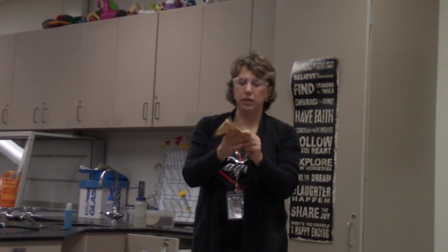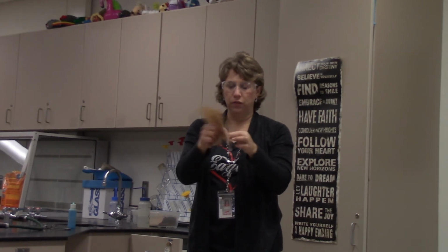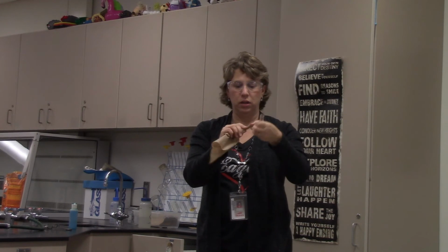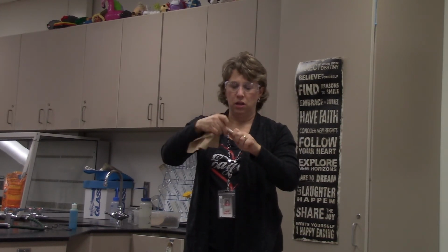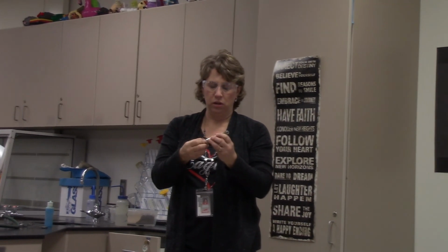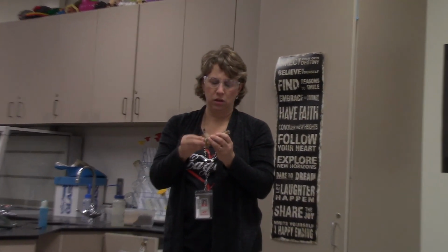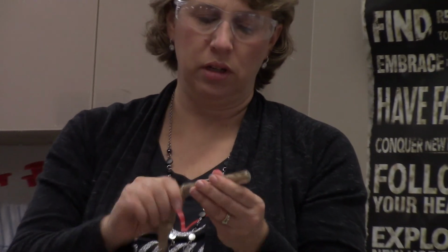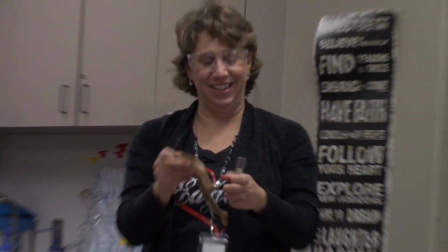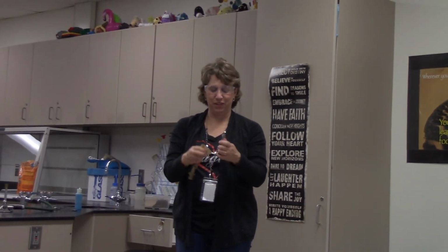To dry my test tube, very carefully, I'm going to take one paper towel, twist it, put it down into my test tube, twist, dry a little bit, and now I should have a clean dry test tube, okay?